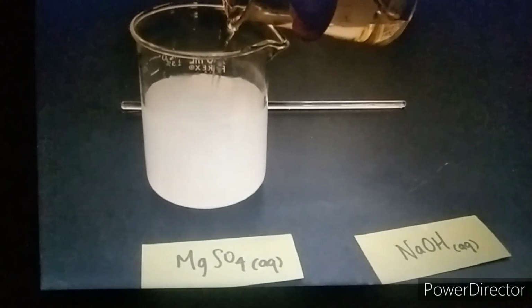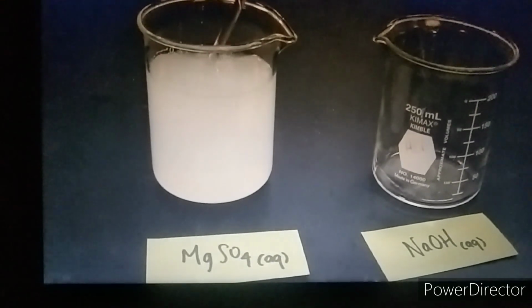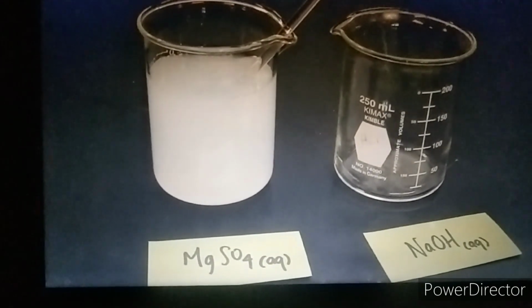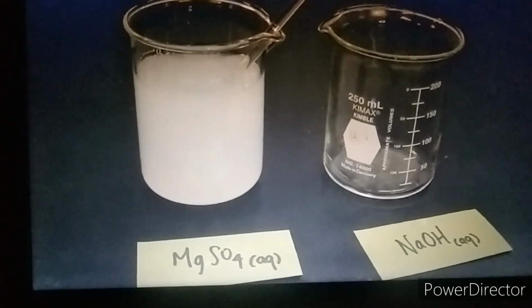You can see a white cloudiness forming right away, and what that cloudiness actually is the product of this reaction is actually a solid produced, and it's called a precipitate. And there's these very small particles that are suspended in that right now, but if we let this settle out over time, we find that they collect in the bottom as a solid.